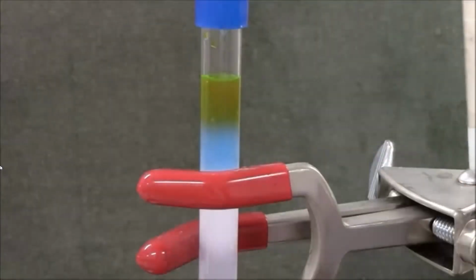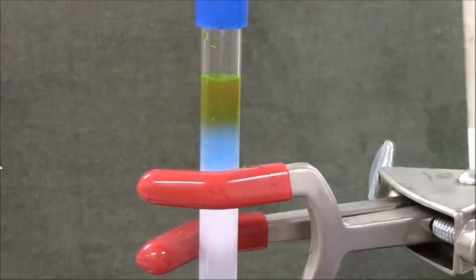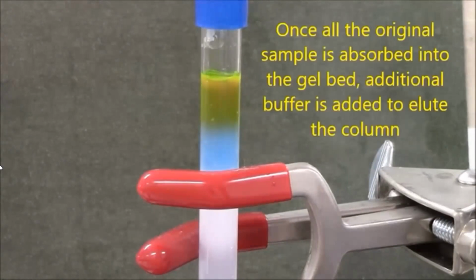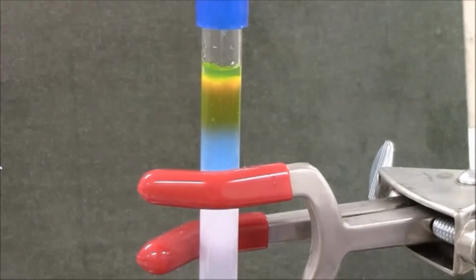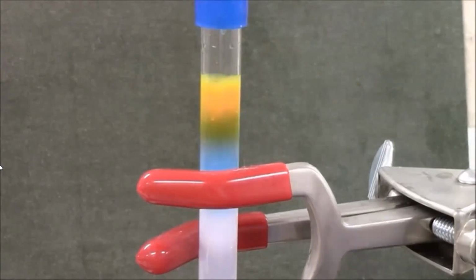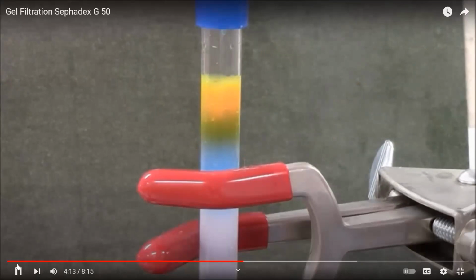Now the excess on the top of the gel is all soaked in. So I'm adding buffer very carefully to the top of my gel filtration column. I'll just add a fraction of a milliliter first. Help get everything into the gel before I add a large volume of buffer. So now the separation has proceeded.